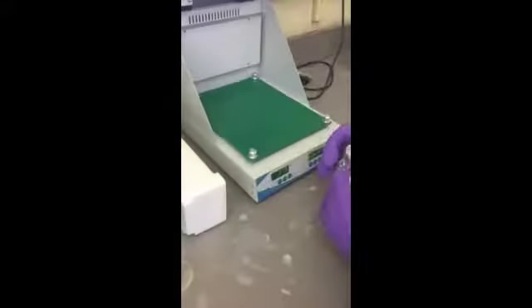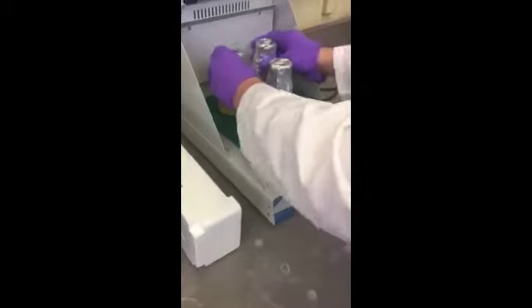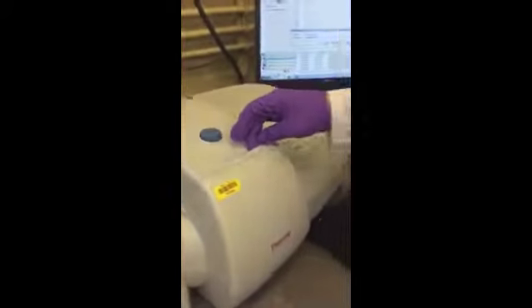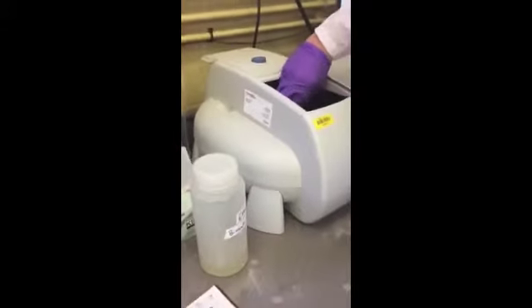After all 3 samples have been taken, be sure to place the aluminum foil back on each flask. Carry all 3 flasks over to the benchtop shaker. Be sure to firmly put each flask on the shaker. Close the benchtop shaker. Take a reading of each sample in the spectrophotometer. Record the reading in your lab notebook and dispose of the sample in the appropriate ethanol waste container.